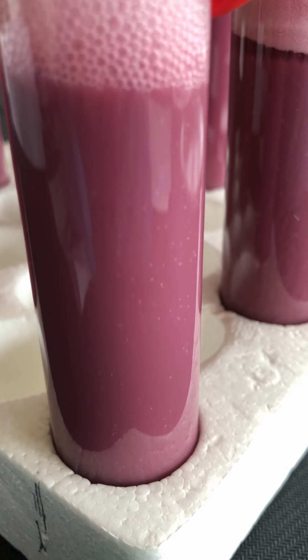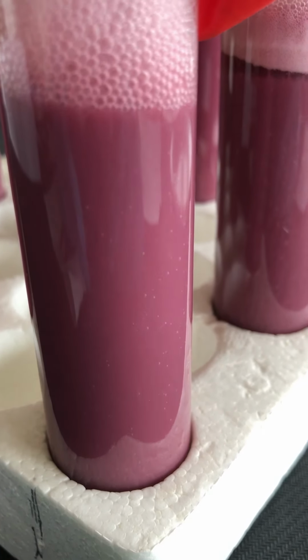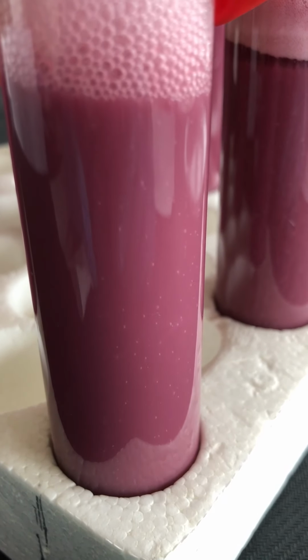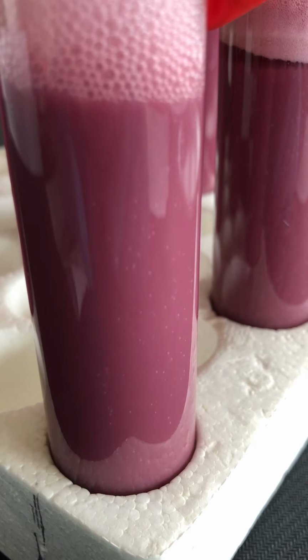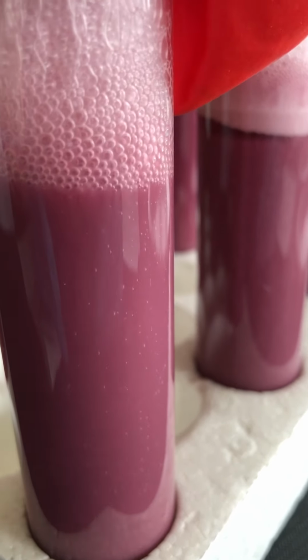All right, showing a close-up of some of the bubbles that are being produced through this fermentation process. You can see that the gas evolution is occurring, and it's obviously moving from bottom to the top, where there's a lot more headspace within the vessel itself, within this glass tube. And this one in particular is connected to the balloon.